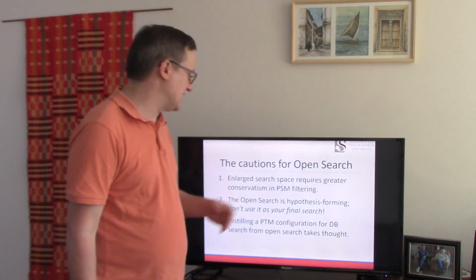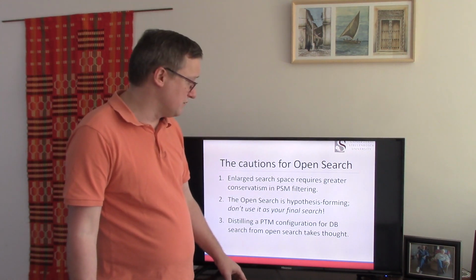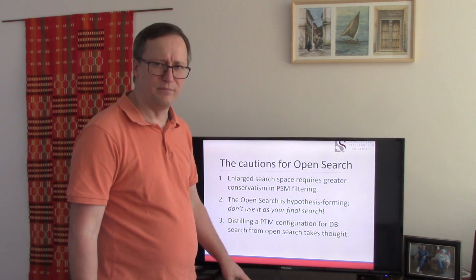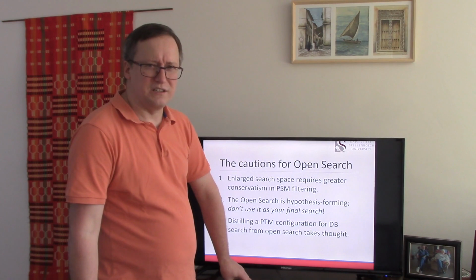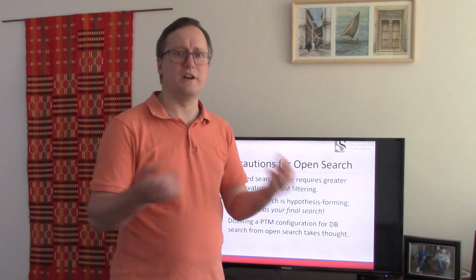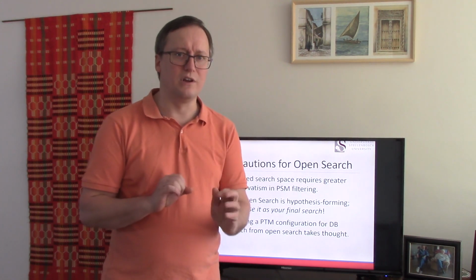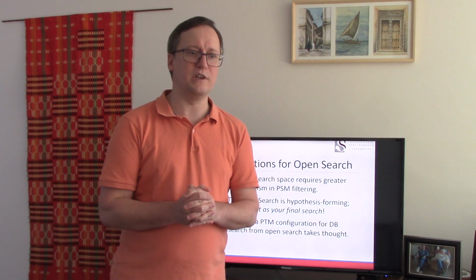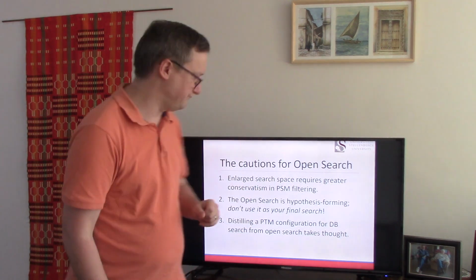So what are the cautions that come out of this? Certainly, an enlarged search space requires greater conservatism in PSM filtering. If you are using lots and lots of tricks that take us outside the standard target decoy FDR assessment, you need to be sure that none of those changes cause violations to the target decoy rules. And some of these systems, I think, are better at resisting that kind of mistake than others.